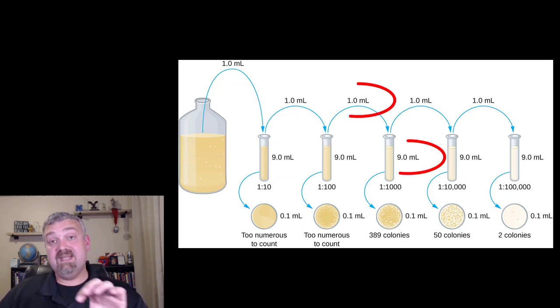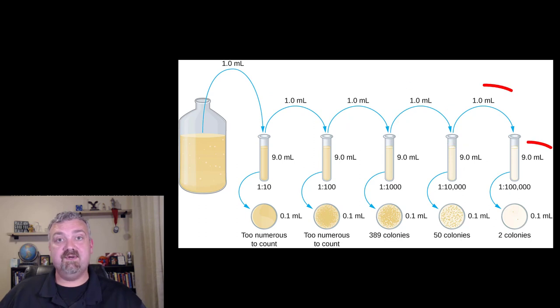Then you're going to continue to do a series of dilutions, which is why it's called serial dilution. So you mix it up real well and real thoroughly. Then you go back in tube number one and take out a milliliter that you're going to transfer into tube number two.